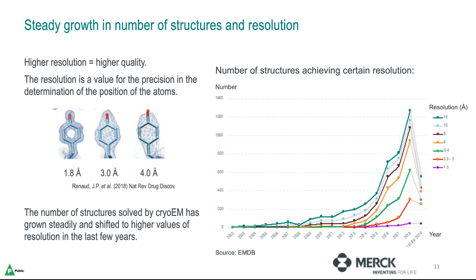But not only that, also the level of resolution, that is a measurement of the quality of the structures, has improved dramatically in the last few years too.